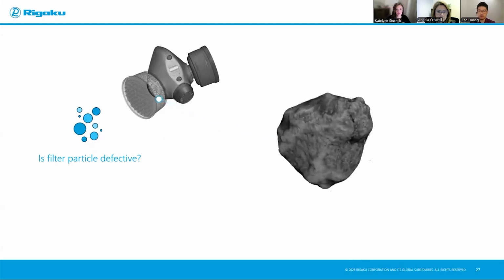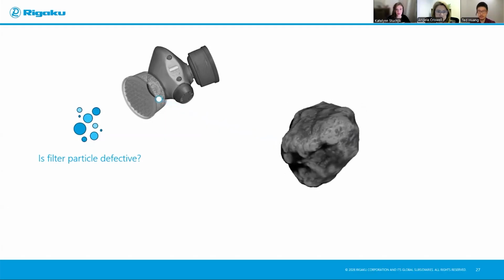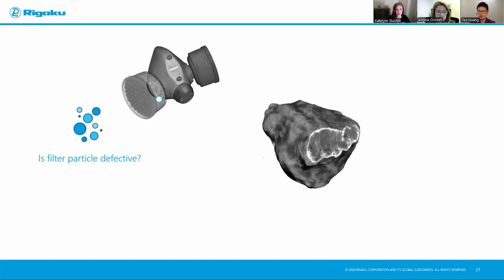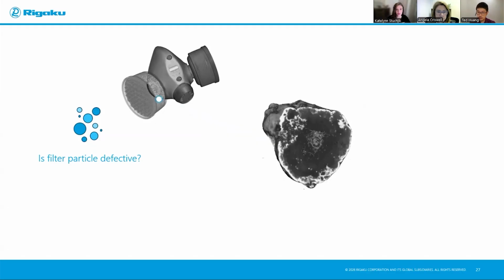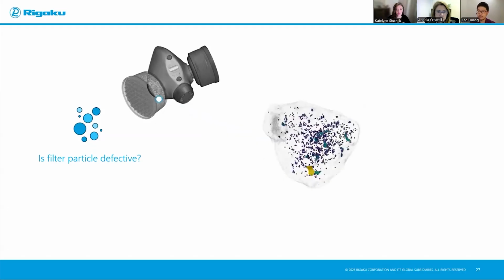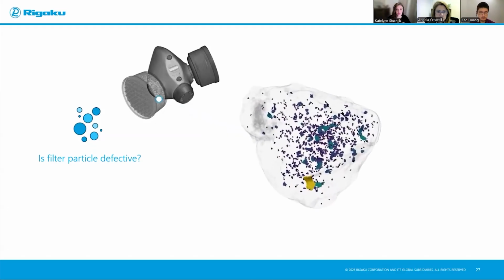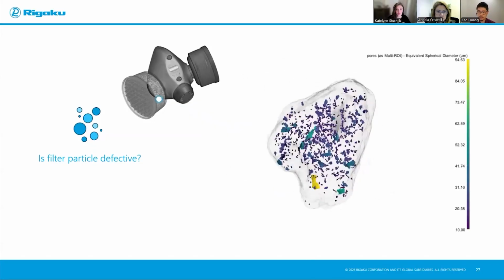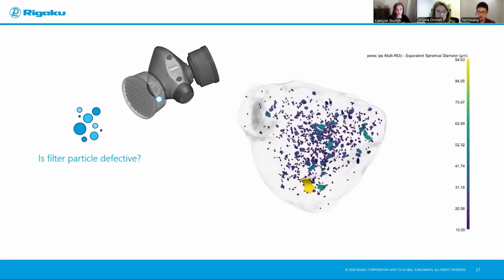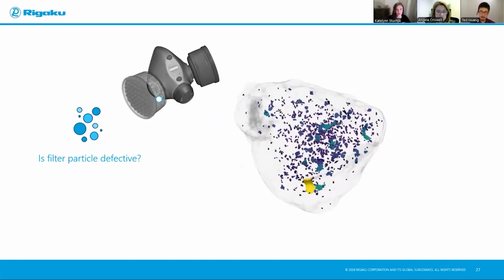So just look at the morphology of your particle and then slice it open in 3D just so that you know exactly what you're looking at. And you can ask the question, oh, is there a coating there? You can see there seems to be a higher density coating. And just as a demonstration, I did a porosity analysis of these kind of particles inside this kind of sample that I just prepared.